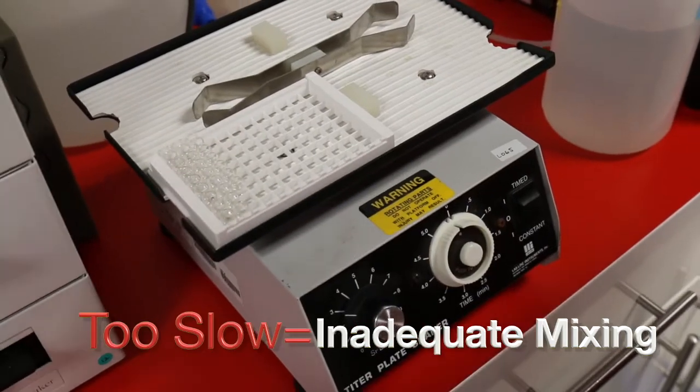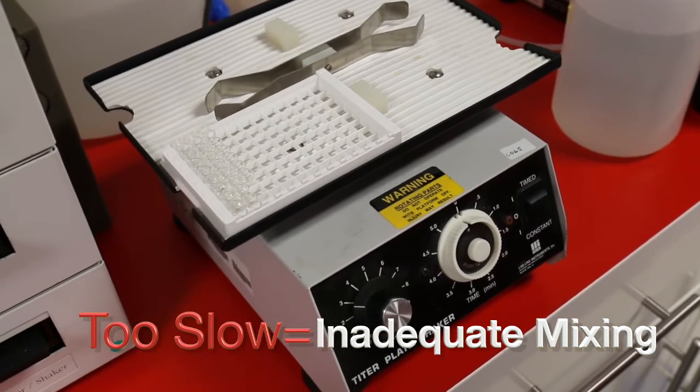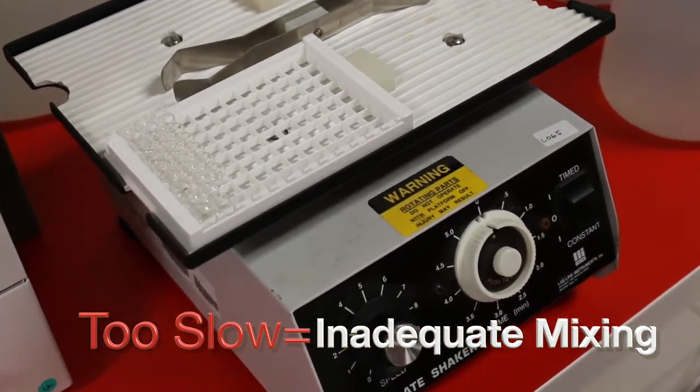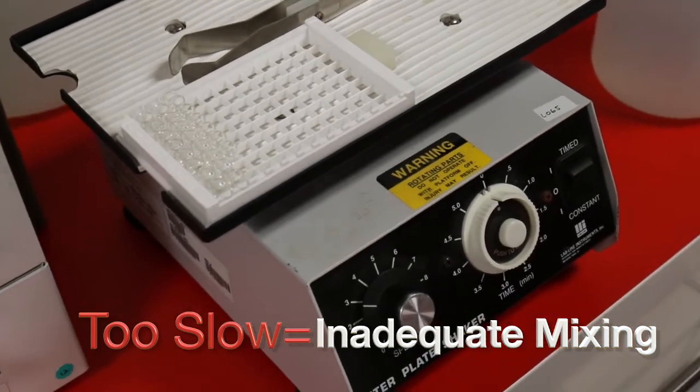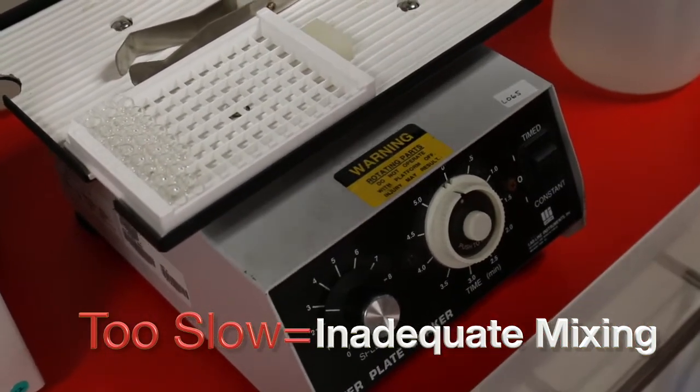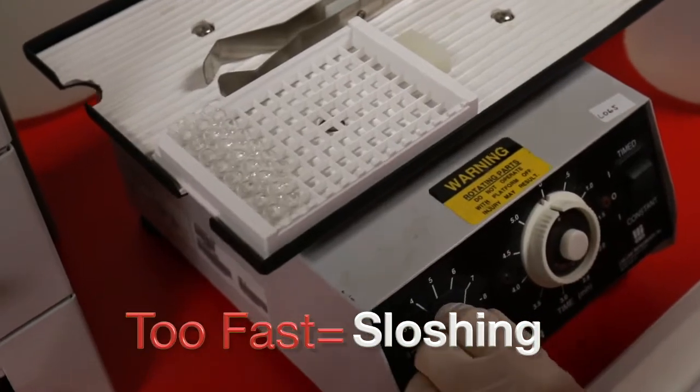When an assay protocol says to incubate with shaking, set your plate shaker to a speed where the liquid in the wells is moving significantly.